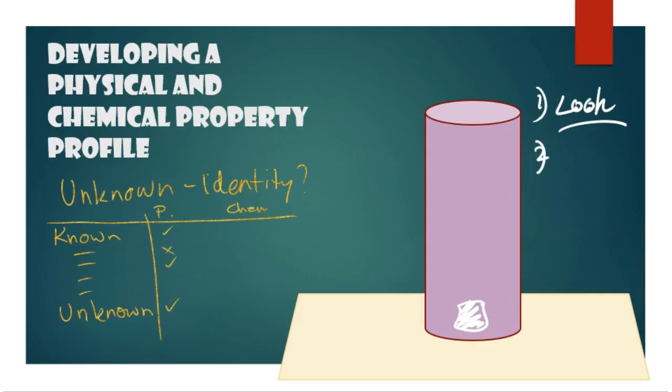So we always start with the simplest substance. We start with water. So you're going to be mixing it with water, and if it doesn't chemically react with the water, then you're going to be doing some tests on it to look at other physical characteristics of it. And chemical, you could call them chemical, because one of the things you're going to be checking is its pH. That's whether or not it turns into an acid or a base when you mix it with water.